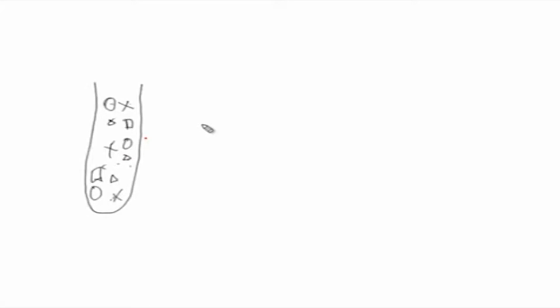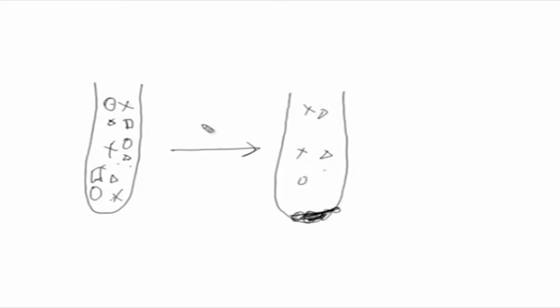Now, when you apply a particular centrifugal field, for example, say 1000 G, then the larger components will settle, like we said cell debris and other very heavy nuclei. So, you will get a pellet here, depending on what kind of rotor you are using, and the pellet will be formed accordingly. The pellet will contain, say, the biggest molecules. Now, the problem is why you get partial purity, and you will also get these things which are again distributed all over actually.